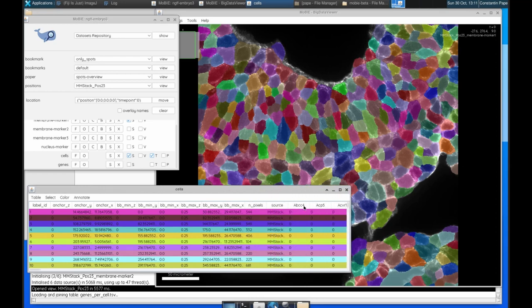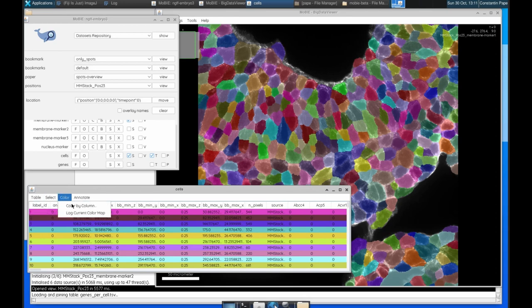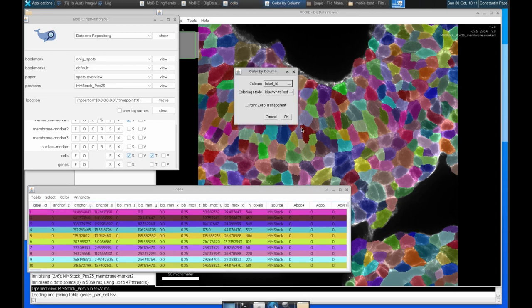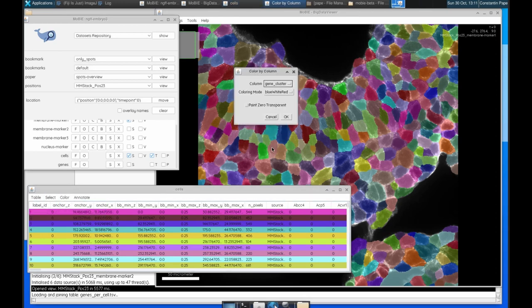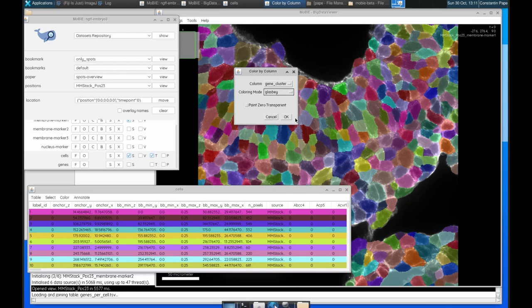So now we can go and we can color, color by column. We can find our new gene clustering, let's use the Glasby color scheme, click OK.